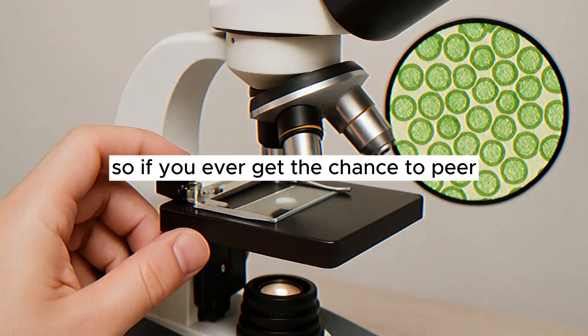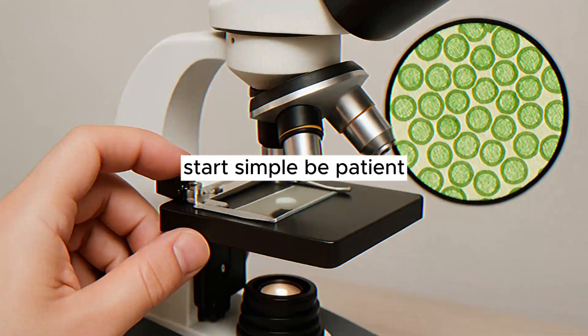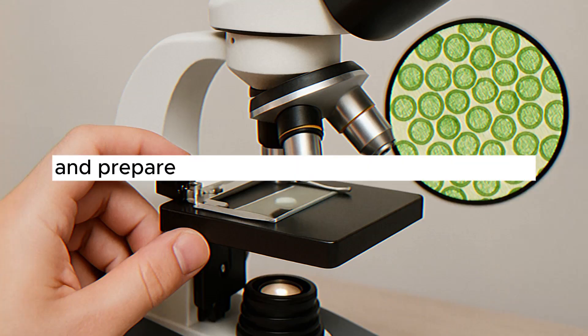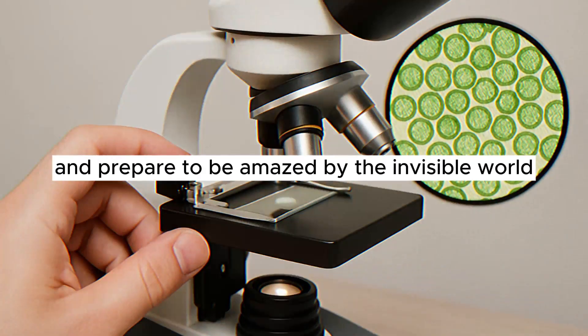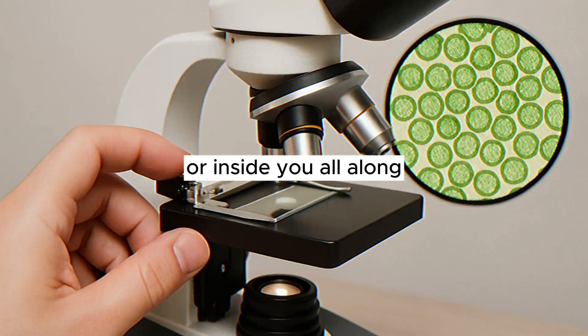So, if you ever get the chance to peer through a microscope, take it. Start simple, be patient, adjust the focus and light, and prepare to be amazed by the invisible world that's been right in front of you, or inside you, all along.